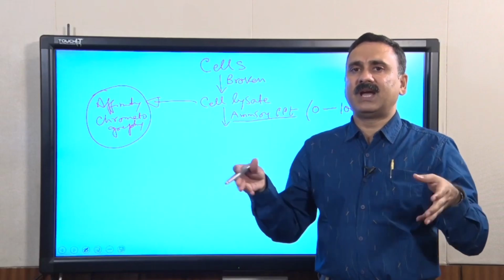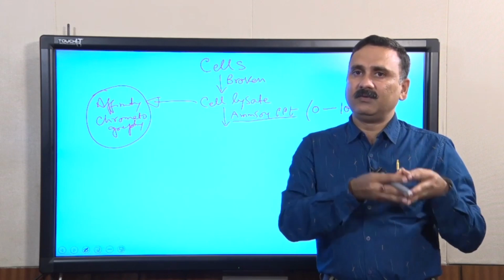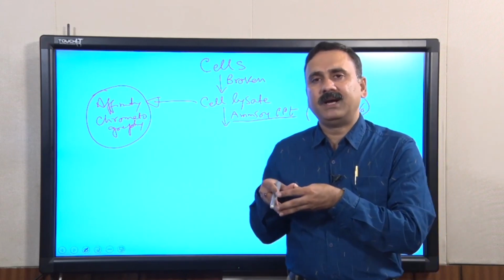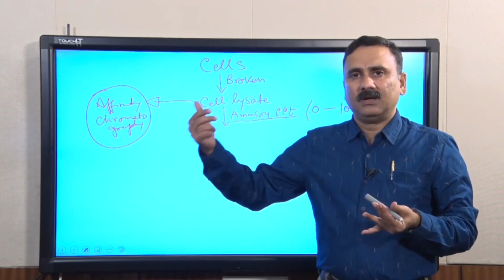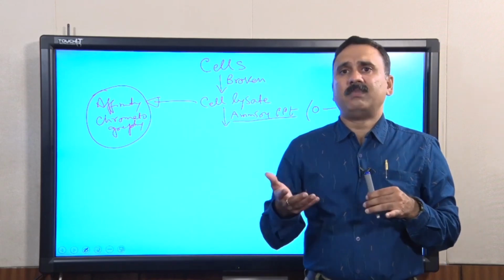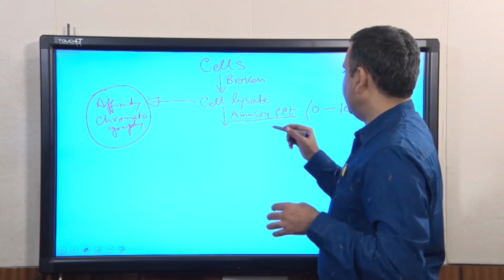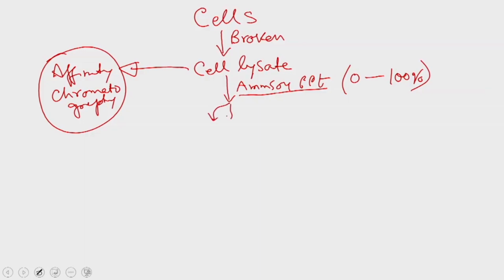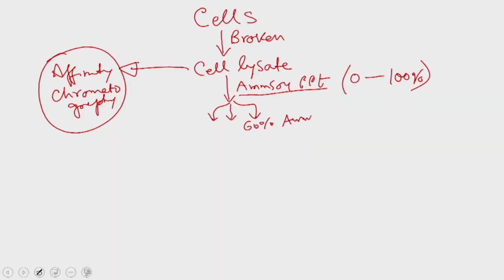All these different fractions can be collected and tested for the presence of your protein, either by Western blotting, or by enzymatic assays, or sometimes simply by looking at the SDS-PAGE and the molecular weight of your protein, because we are talking about cells which are overexpressing your protein. Now, you have the different ammonium sulphate fractions. Suppose 60% is the fraction where your protein is present. Now, I have this 60% ammonium sulphate fraction.